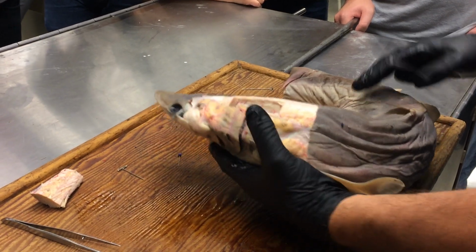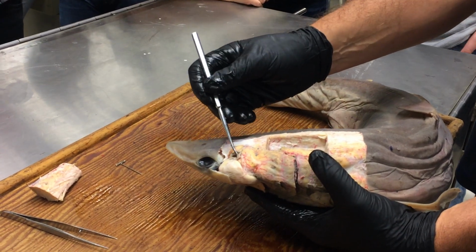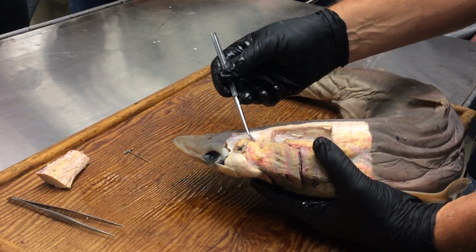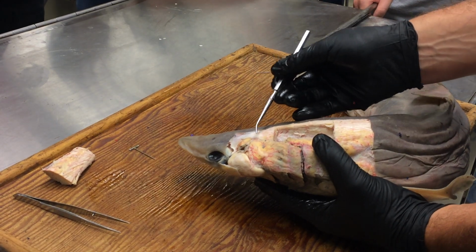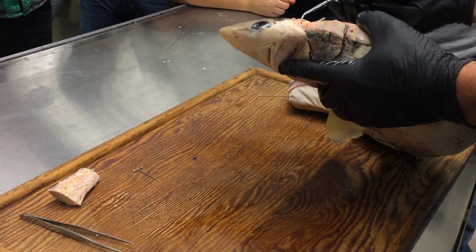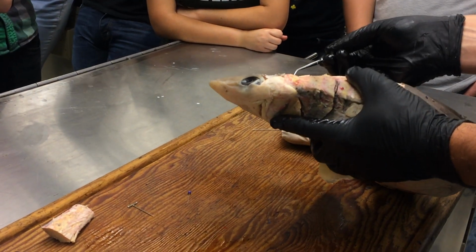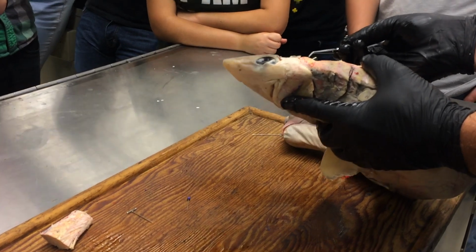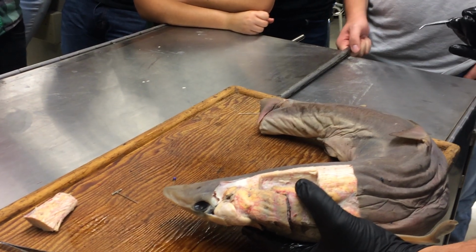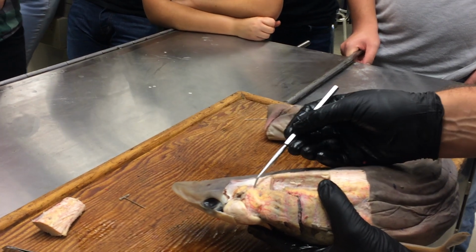Dorsally, the hyoid includes this big muscle right behind the spiracle, and that lifts up the hyomandibula, the hyomandibular cartilage to be precise, this cartilage that runs down from the otic capsule to the region of the jaw joint, kind of buttresses the jaw. And that, since it lifts up the hyomandibula, would be called the levator hyomandibulae. Exactly. Yes, that's levator hyomandibulae there.